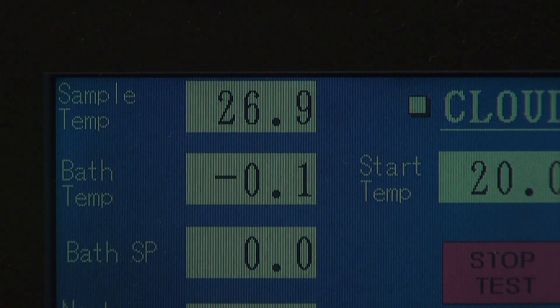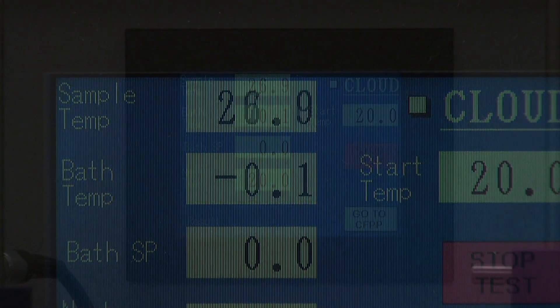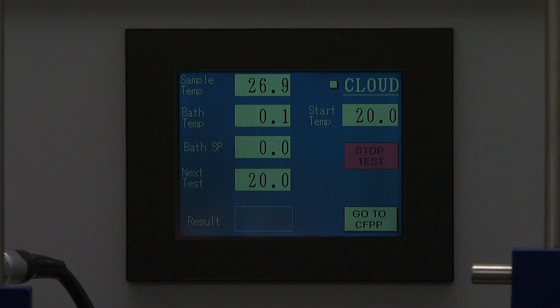The following variables will appear on the screen. Sample Temp: this is the current temperature of the sample itself. Bath Temp: this is the temperature of the cooling bath; the temperature will change as lower temperature ranges are required. Start Temp: this is the temperature at which the automated system will begin checking the sample to see if the cloud point has been reached. Bath SP: this is the temperature the bath is attempting to reach; the temperature will change as lower temperature ranges are required.